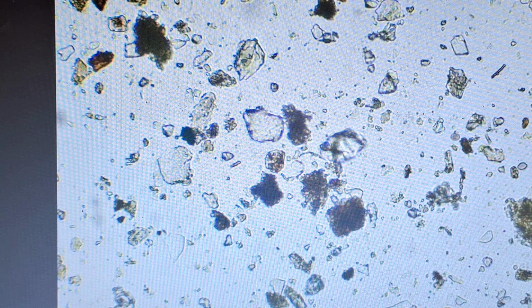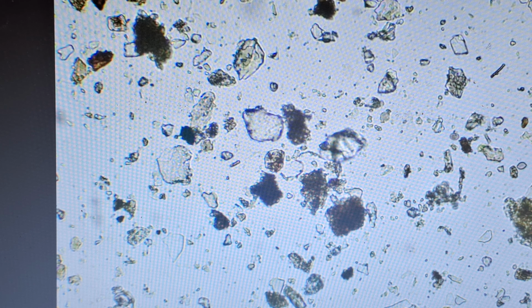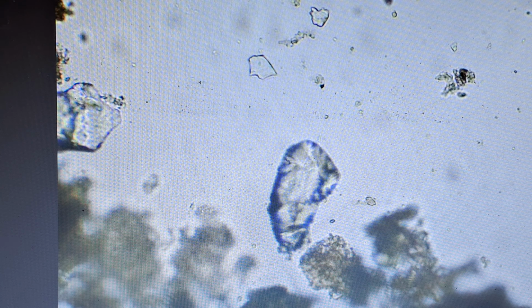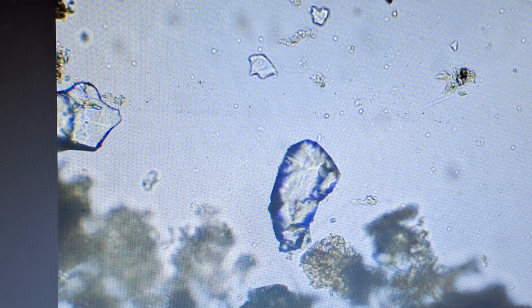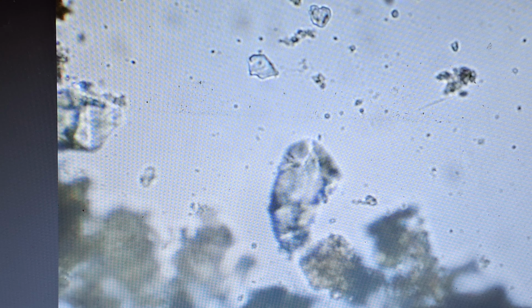So let's pause here, and I'm going to go to another sample, the sample of compost tea, and that's going to be more anaerobic as compared to this aerobic environment. So here's the other slide. This is the sample of what was an aerobic compost tea extract. I just extracted some of the compost by soaking it in water, but I've let it sit a few days, so it's gone anaerobic. We're seeing things clump up.